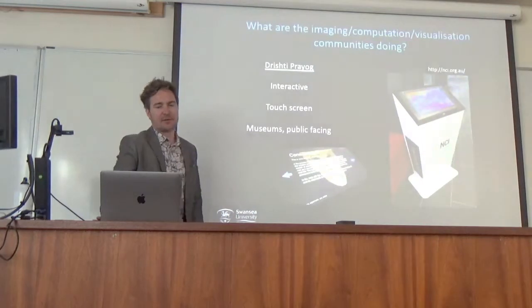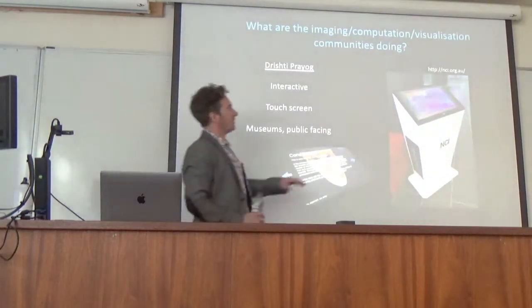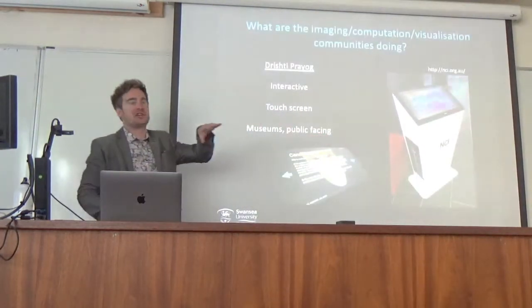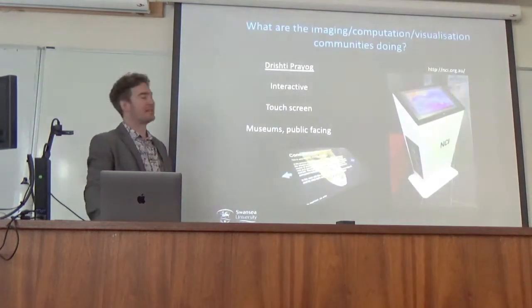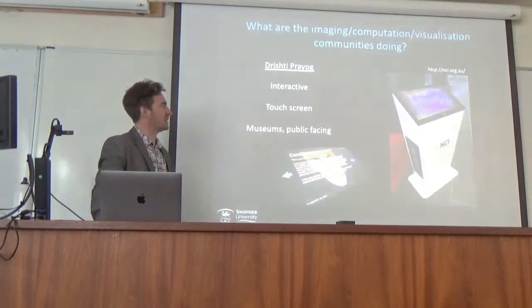So we've used that a little bit, and it's a really good way of visualizing it. It can work on global scale data, weather forecasting maps, GIS data, all the way to our microstructure of the inside of an ant head. It's very good with 3D data.